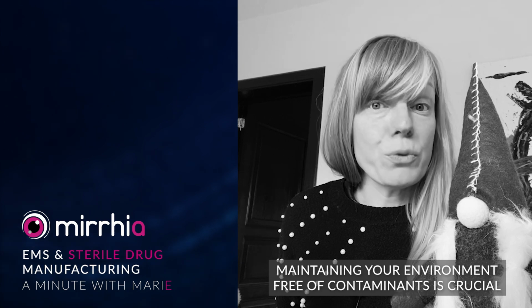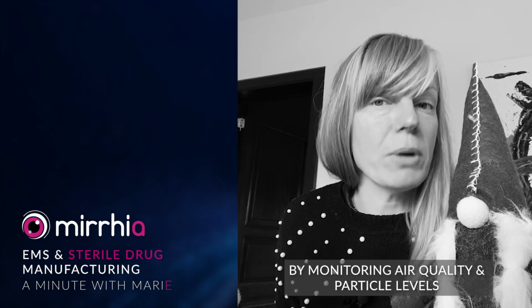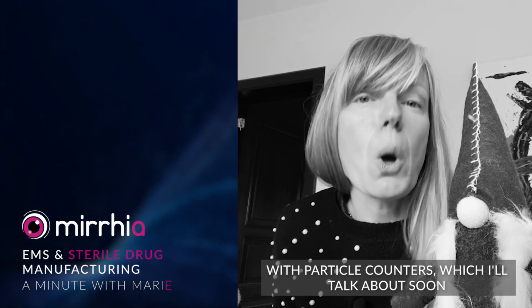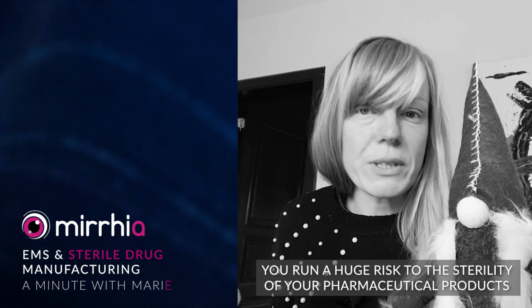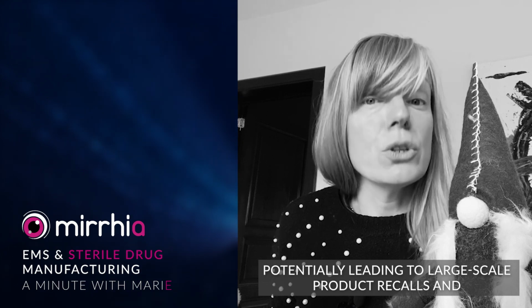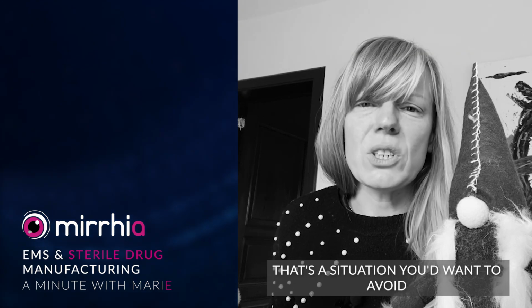Maintaining your environment free of contaminants is crucial. Fortunately, the EMS is there to assist you by monitoring air quality and particle levels with particle counters, which I'll talk to you about soon. Without an EMS to monitor and alert you, you run a huge risk to the sterility of your pharmaceutical products, potentially leading to large-scale product recalls and damage to your company's reputation. That's a situation you'd want to avoid.